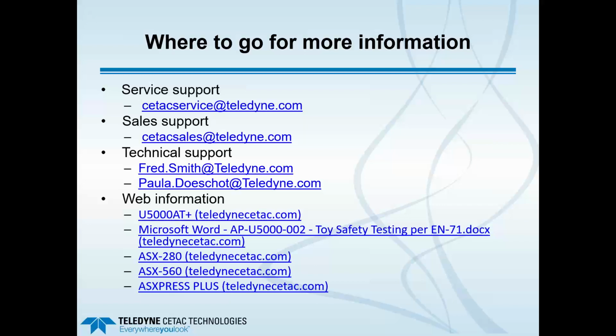Okay. So, in summary, when you do use an accessory like this, you are extending the lower range of detection for your ICP optical system. So it can then allow you to do more applications with the ICP-OES, or to be able to meet regulations, especially as regulations may become more stringent.